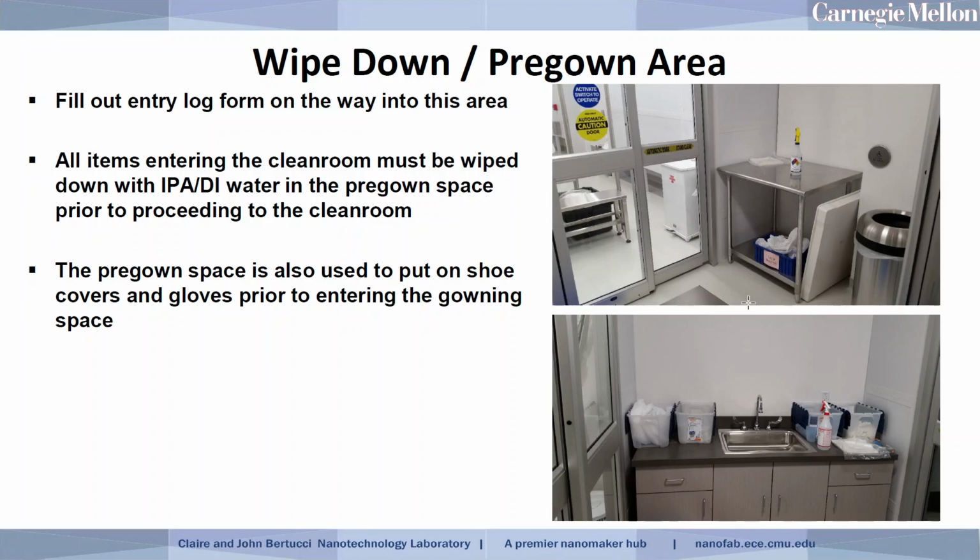Anything that we're bringing into the clean room is going to need to be wiped down with an IPA DI water mix in this space. So we have a spray bottle and some wipes in this area for that purpose. We also use the pre-gown space for putting on shoe covers as well as pre-gown gloves, and there will be dispensers for those in this area as well.